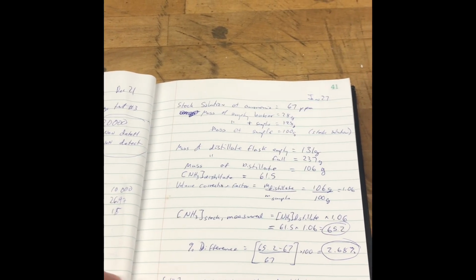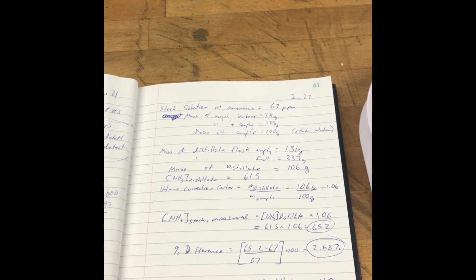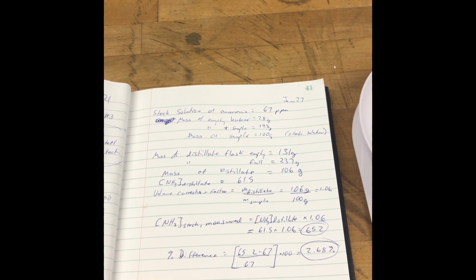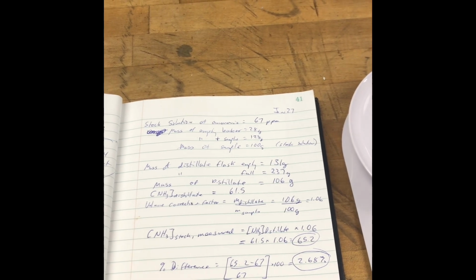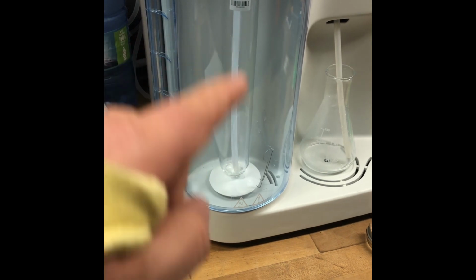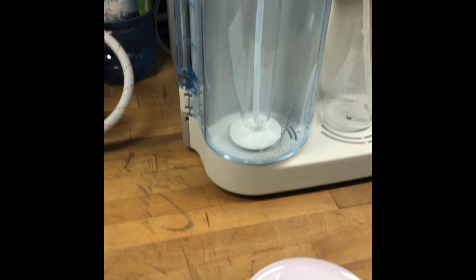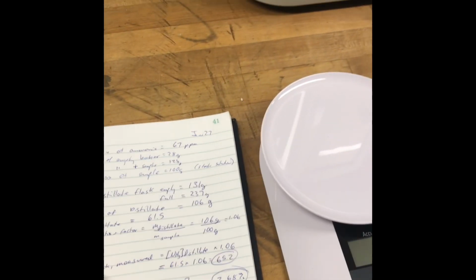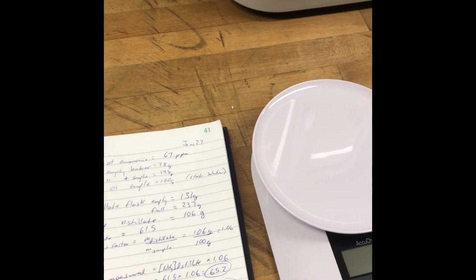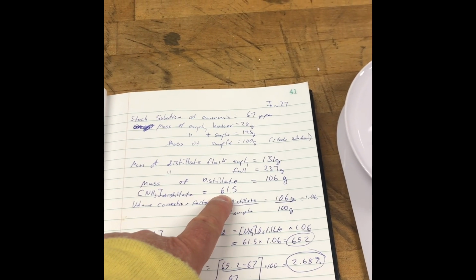So I measured the ammonia concentration in the original sample after distillation, and I got a non-detect. So the ammonia in this side after the distillation is basically not detected by my test method, whereas the ammonia detected in the distillate was measured at 61.5.